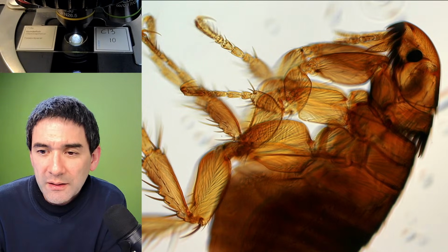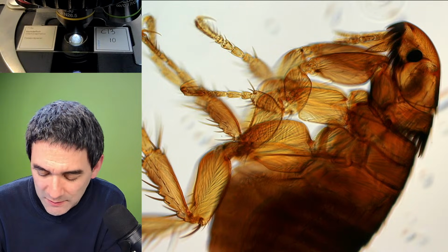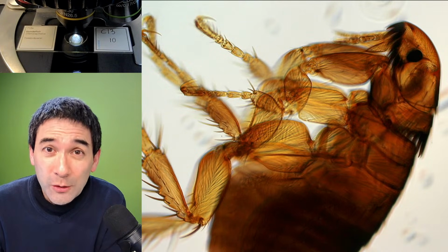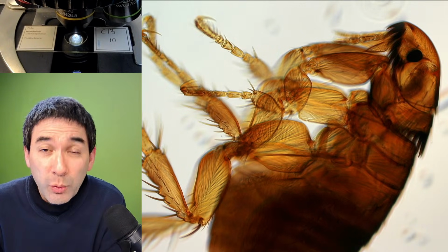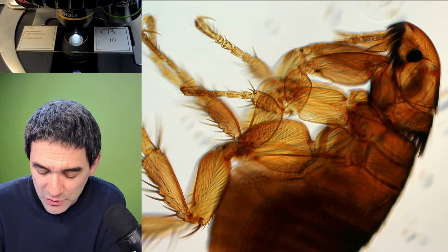I typed in the link in the chat. It's a German company. You can download their huge slide catalog. But let me tell you, they're not the cheapest ones, okay? But they're high quality. Yeah, so they're making those slides also for medical training and so on.